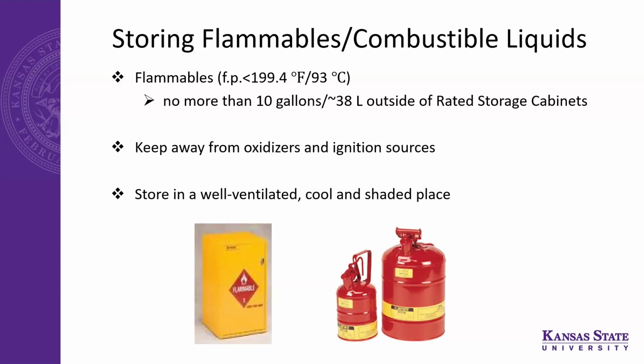My oxygen is here, acetylene is here. I need to work with these two gases. The process is that I need to mix these gases and then send them into my reactor chamber. Right now they are very close to each other because each of them has regulators and an individual piping system. As long as I don't have any igniters around, I'm a physicist, I think it is still safe.